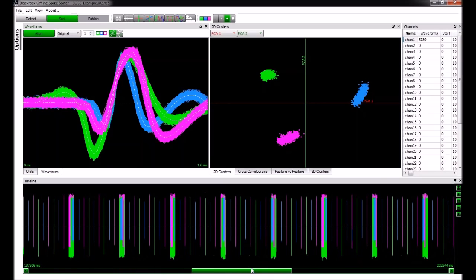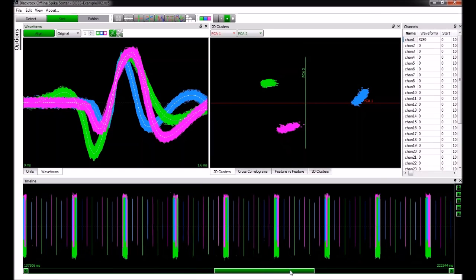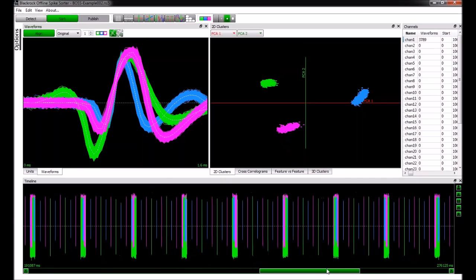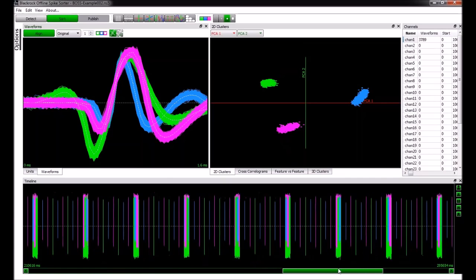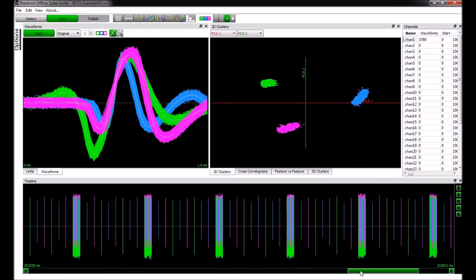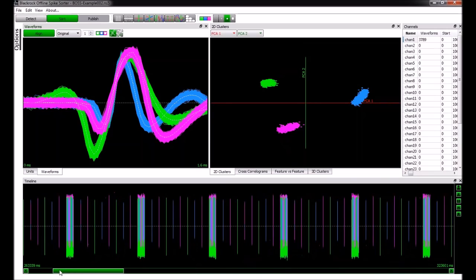That is one option for dealing with changing amplitude in spikes, or at least a common method that I've seen. And I usually like to do this also just to ensure that I am being accurate and double checking my work anyway.